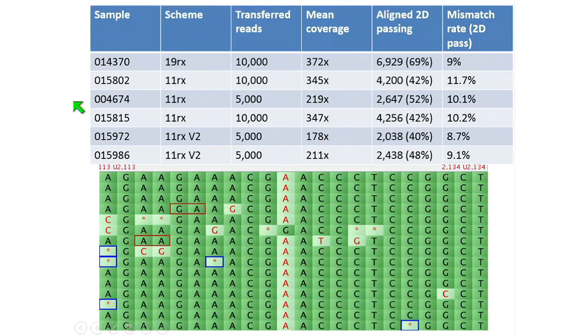And what we have found is that this is a real-time system. You don't have to just keep running it. The runtime is up to 48 hours, but you can run it for as long as you need to generate the information you want. In fact, different to most genome sequencing projects, we're trying to generate the smallest set of information that we need to get the job done, because we have to upload all this information.